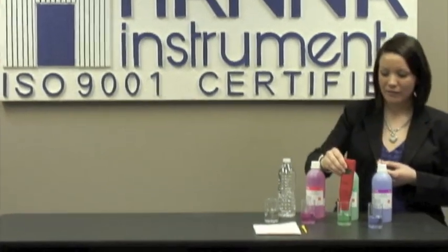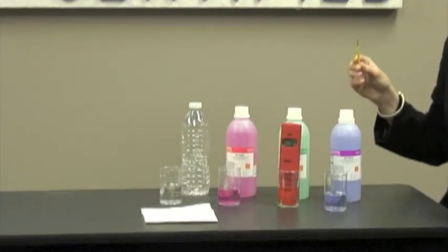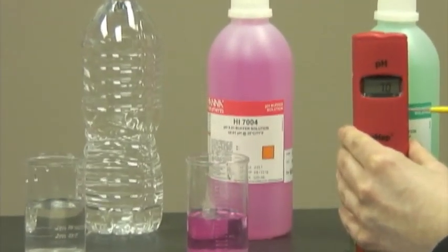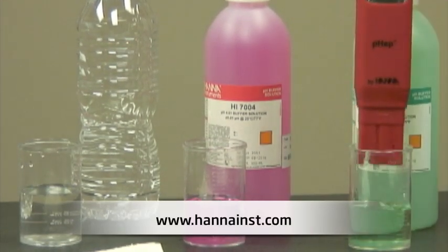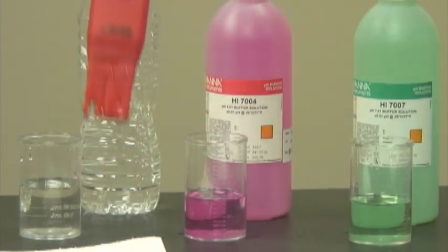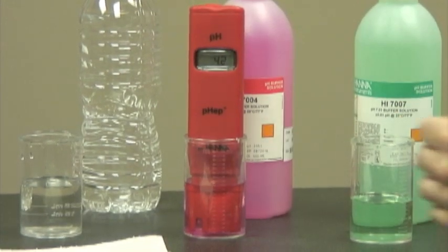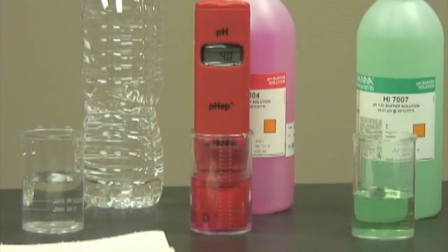I'm going to turn the instrument on, put it in the pH7 buffer, and then take my calibration screwdriver and turn it until it reaches pH7. Then I'm going to rinse in purified water, and because I'm measuring an acidic solution, I'm going to do it in a pH4 buffer, and calibrate it until it reaches pH4.